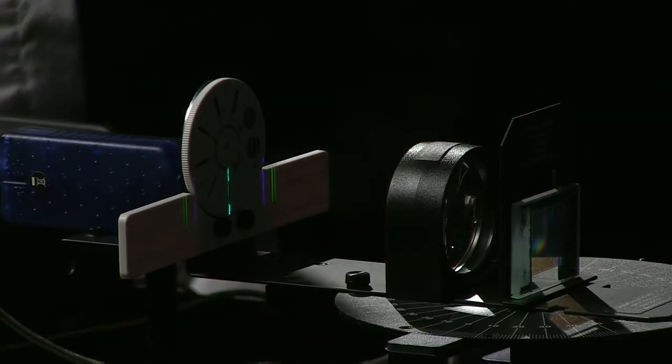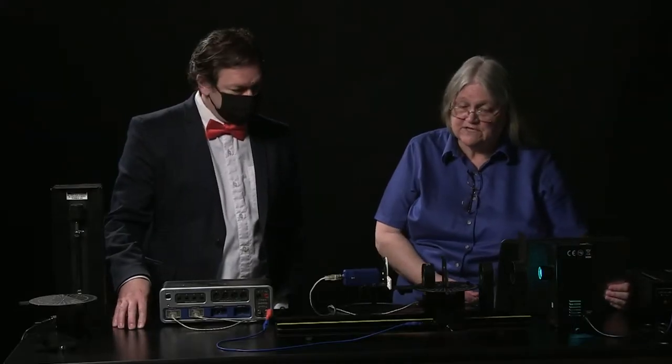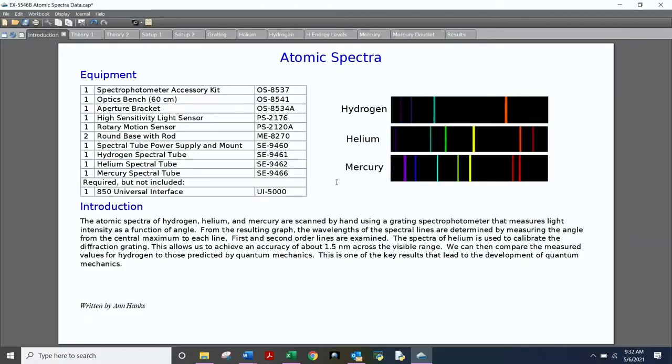We're going to be looking at the atomic spectra of Mercury, simply because Mercury is a really bright source, which makes it easy to show in this lighting. And it has beautiful spectral lines — it does have nice lines. We love Mercury.